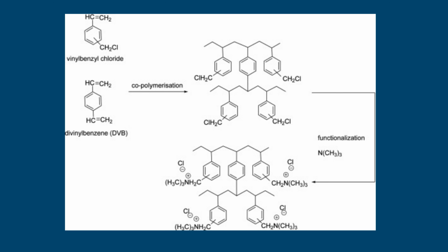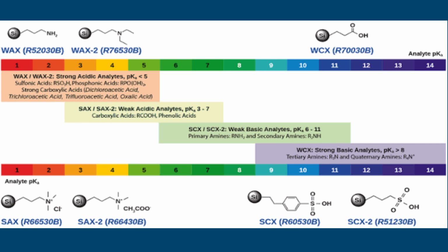Common classes are strong anion exchanger, SAX, quaternary ammonium groups. Weak anion exchanger, WAX, protonatable amine groups whose charge depends on pH.